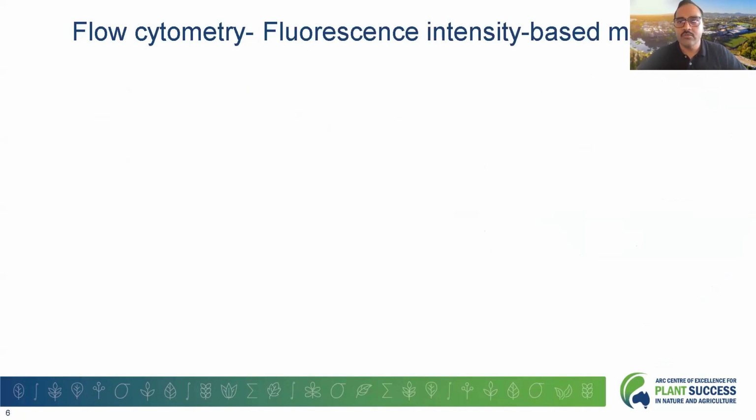So now we're moving on to flow cytometry. What is it, and how does it work? It's a fluorescence intensity-based method.